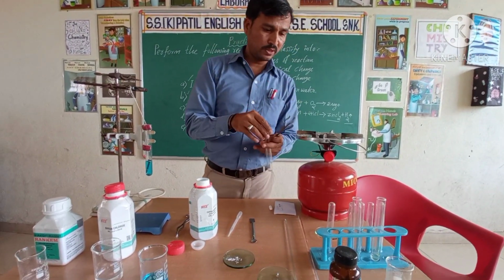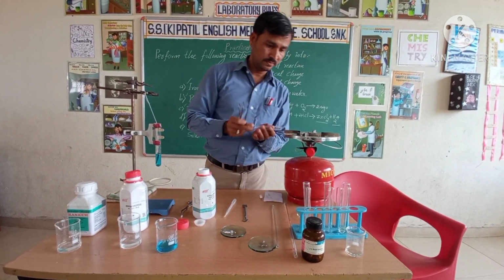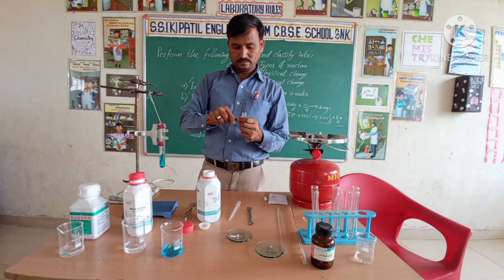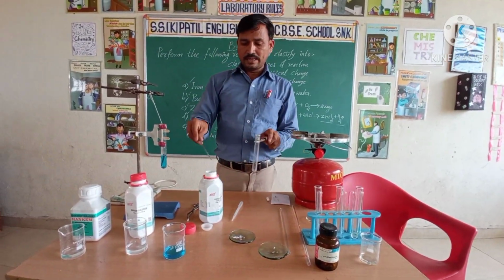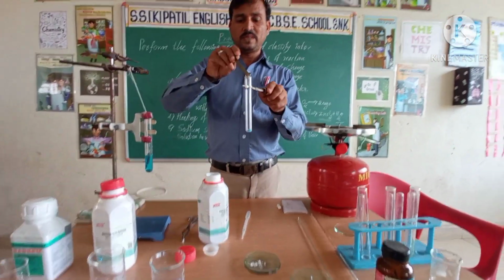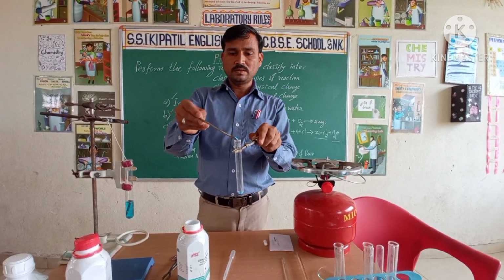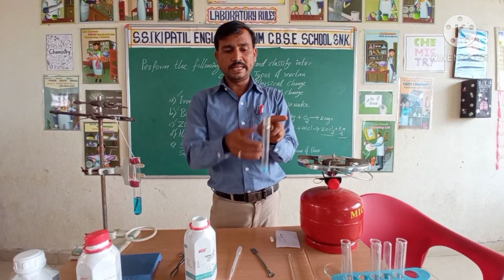We'll hang one more test tube here. We'll add dry copper sulphate crystals here. Can you see this? Here, we'll heat it.